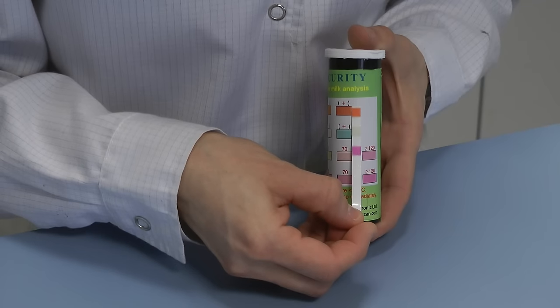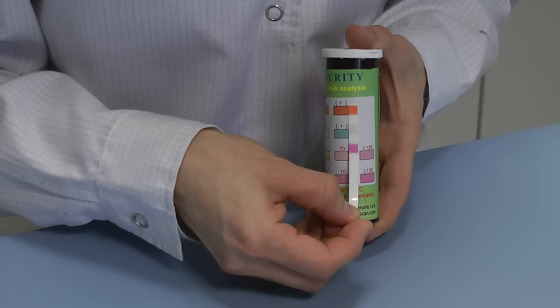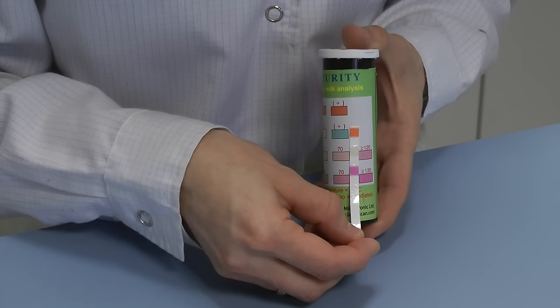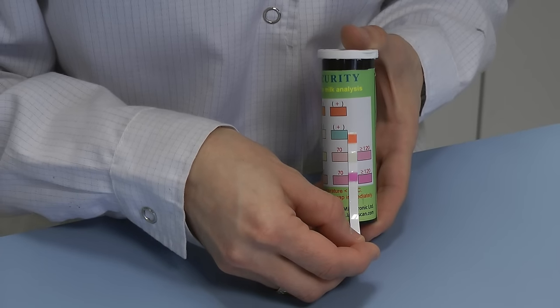When there is adulteration with neutralizers and urea, the third, last indication area is changing its color from yellow to intensive pinkish red.